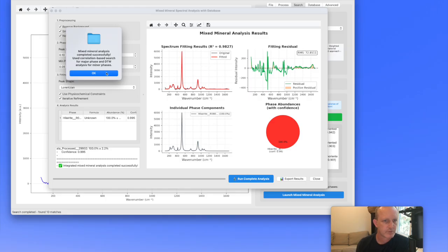So when it searches on the residual, it's going to use the DTW method, the dynamic time warping method, because we're subtracting out the measured spectra from the fitted spectra and searching on the residual. And when you do that, the peaks have an apparent shift because you're removing spectral information. And so the peak shapes are going to be cut off. The data is going to be kind of weird looking. And so you need a different method to be able to search. And dynamic time warping is really good at that.